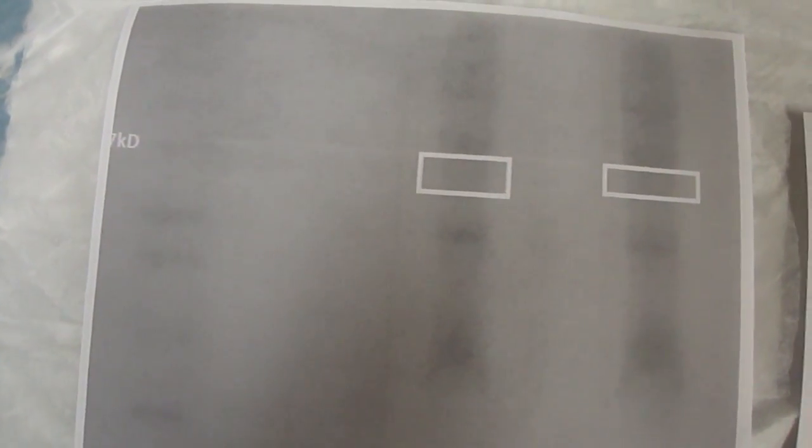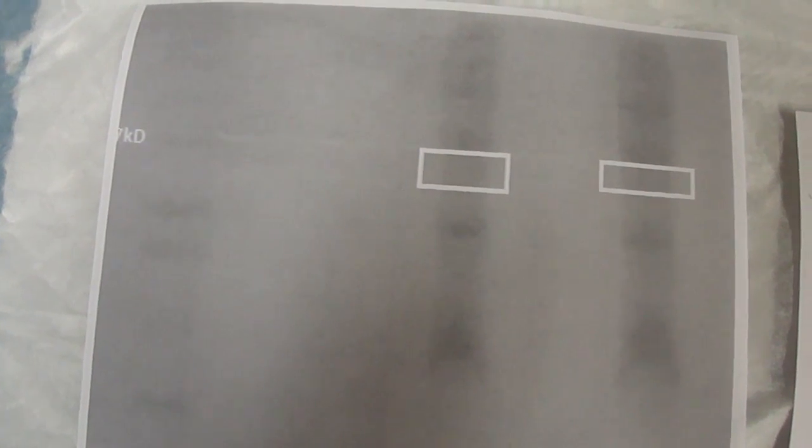From the results of the Western blotting, it showed that there was a presence of the RAGE protein in the avian homogenized tissue. Bands were detected in the 10 µg lane, and the 20, 30, and 40 µg protein lanes. When the mourning dove and rat vasculature were compared in a Western blot, it confirmed the presence of RAGE in avian vasculature.